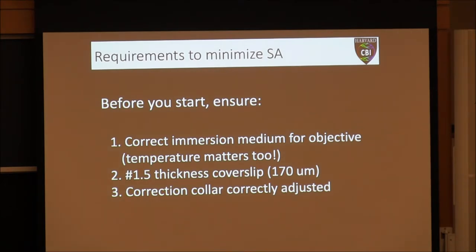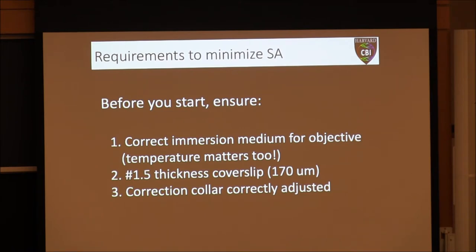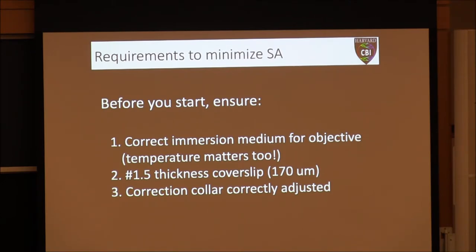Here are three very basic requirements to minimize spherical aberration — the absolute minimum you should do before starting an experiment. First, make sure the immersion medium matches your objective — for an oil objective, use 518F immersion, and remember temperature matters. Second, make sure you're using a number 1.5 thickness cover slip, equivalent to 170 micrometers. Third, if you're using an objective with a correction collar, make sure it's adjusted to the right position.